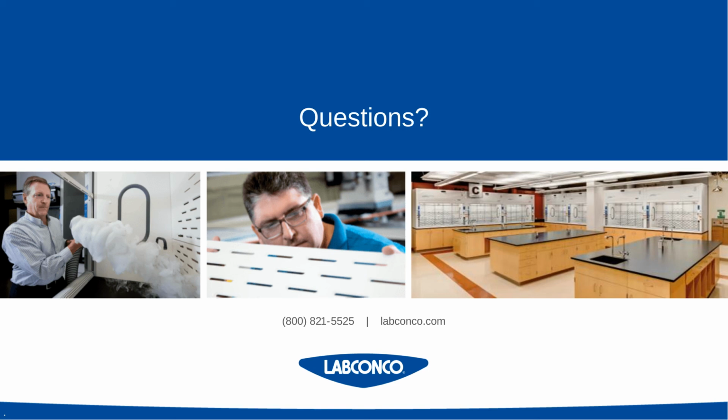Yeah, that's a good question. Ultimately, there are industry standards that point to reasons why we don't recommend turning off hoods, and it's because the risk associated with that is the misapplication or misuse of hoods. For instance, a typical industry standard that exists, and I mentioned it in the presentation, is ANSI Z9.5, and they supply guidance on what you should do before you're able to turn off a hood. One of those is to have the hood completely decontaminated and cleaned, and then backdraft prevention is needed in the ductwork.